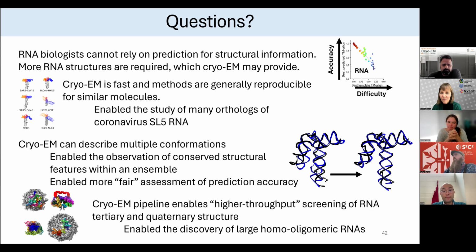We have a couple different questions about the RNA prep process and the refolding. One is, do you do all your RNA refolding in the exact same buffer conditions, or is it very molecule specific? Yeah, that's a good question. Our default for the lab is to do 50 millimolar sodium HEPES, pH 8, and 10 millimolar magnesium. That's default. Obviously, there are some RNAs where we know they need potassium. So something like a G quadruplex, we'd add in potassium.